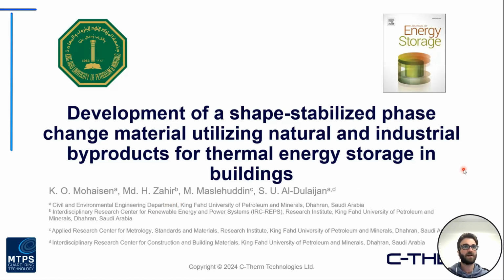So we're taking a look here at a paper. This was published, I believe, a year or two ago: the development of shape-stabilized phase change materials utilizing natural and industrial byproducts for thermal energy storage in buildings. So this is some work coming out of Saudi Arabia. A few different groups were involved, and they used the MTPS method for their study.